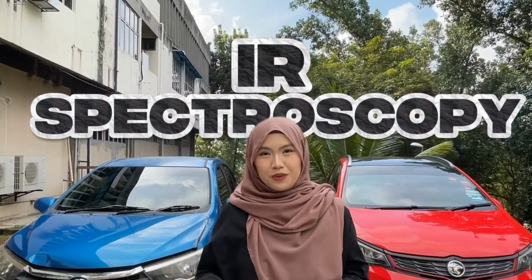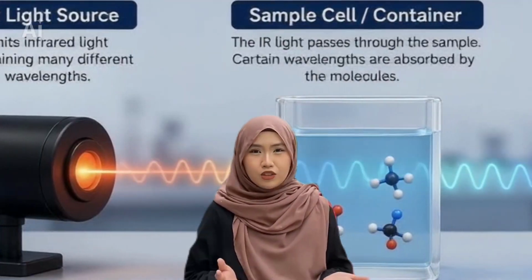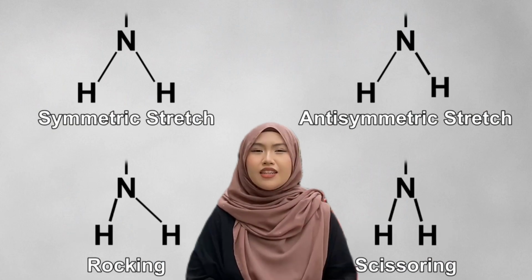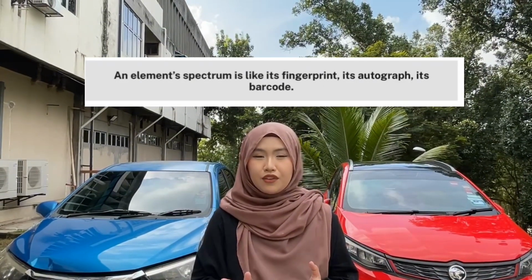Infrared spectroscopy is an analytical technique used to identify and study chemical compounds. It works by passing infrared light through a sample and measuring which wavelengths are absorbed. Different chemical bonds absorb specific frequencies of infrared radiation, causing molecular vibration. These absorptions produce a unique fingerprint which helps identify functional groups and determine the structure of the compound.